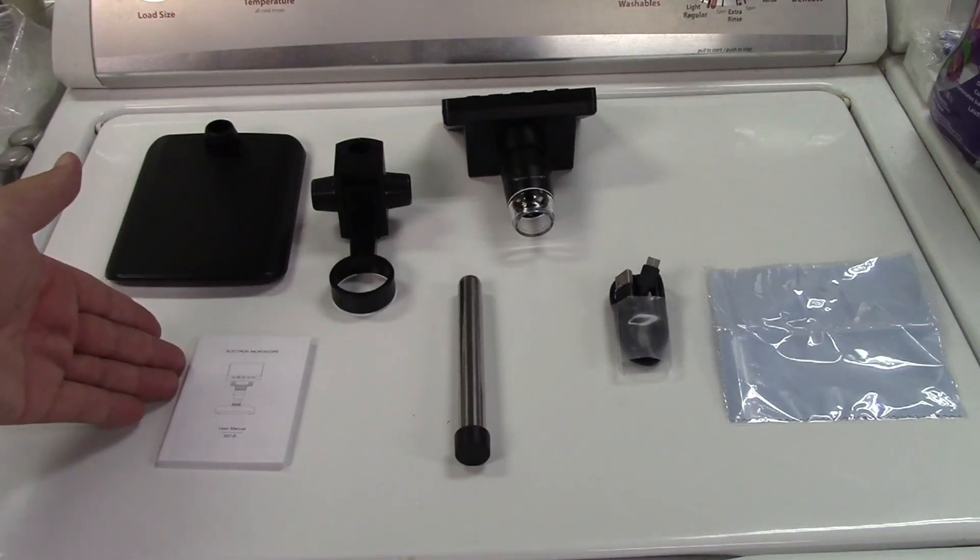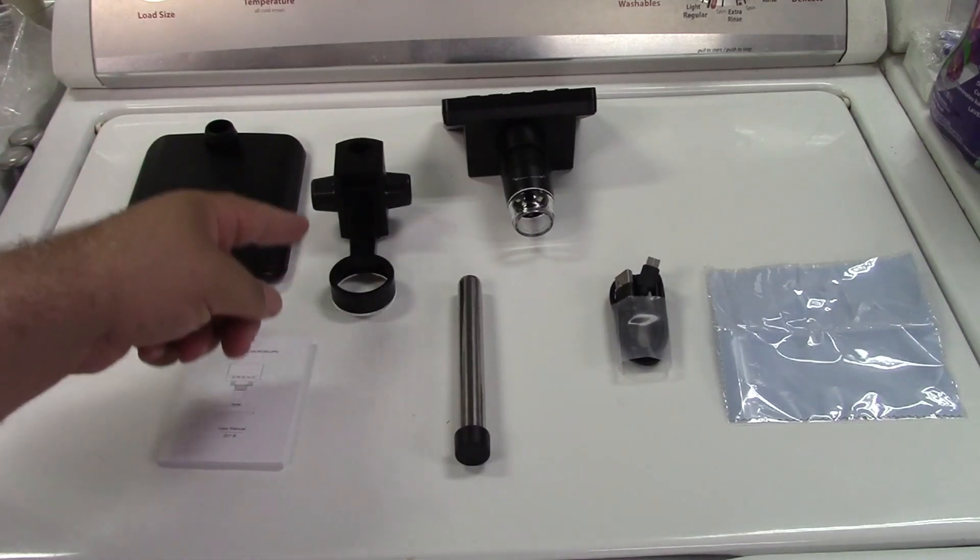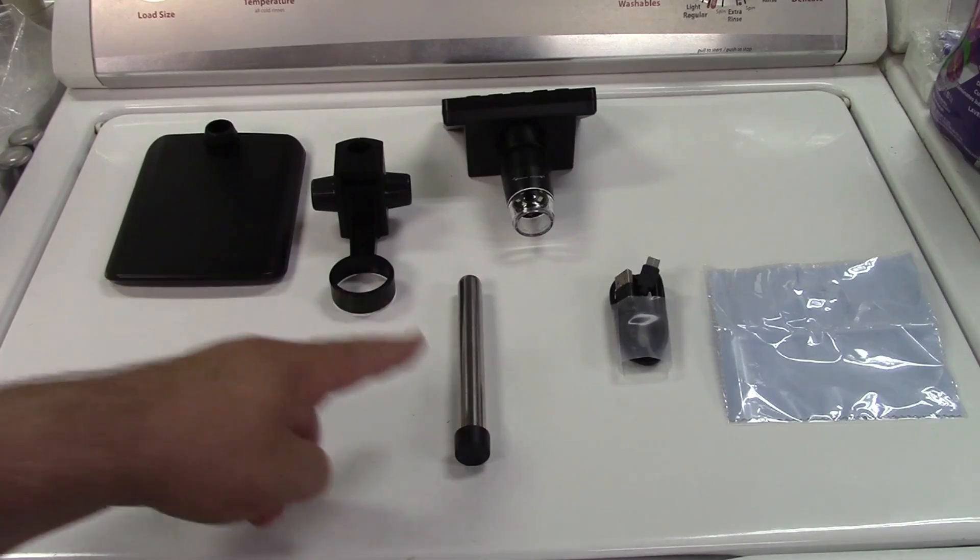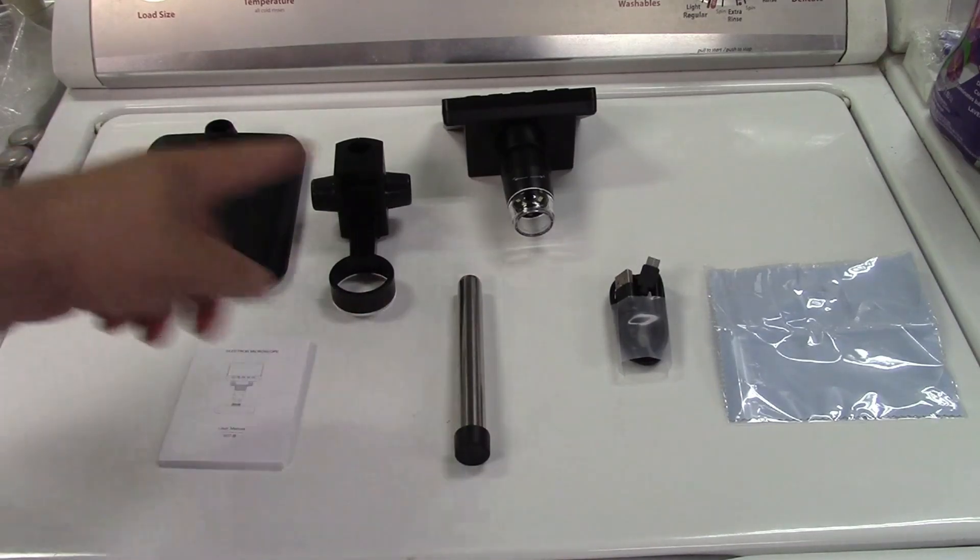In the box you get the instruction manual, the base for it, this is the holder for the scope which also allows you to raise and lower it, this is the column, support column, for everything.